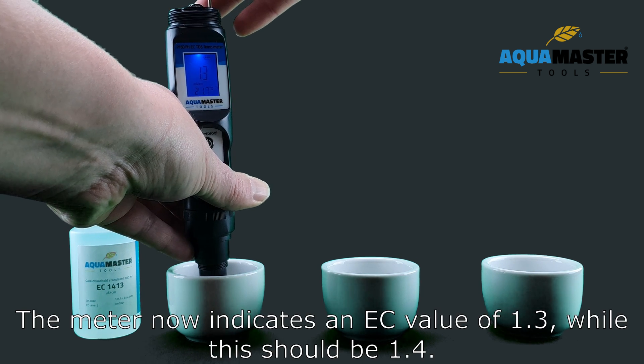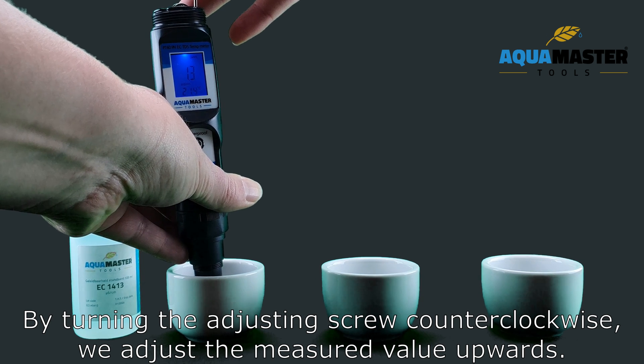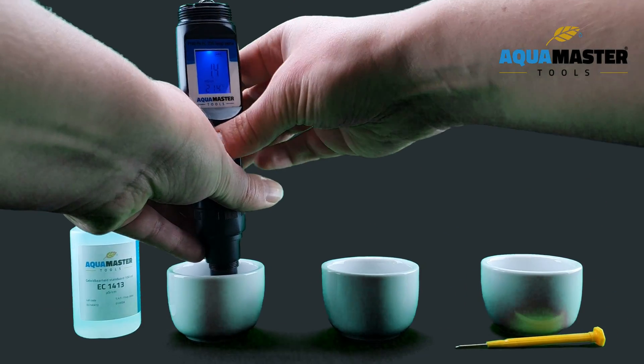The meter now indicates an EC value of 1.3, while this should be 1.4. Turning the adjusting screw counterclockwise shifts the measured value upwards. Turn the adjusting screw until the meter shows an EC value of 1.4.